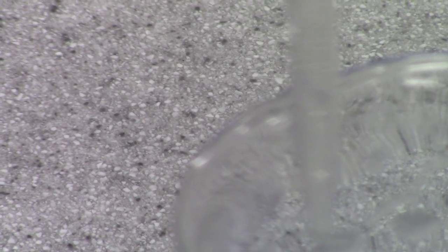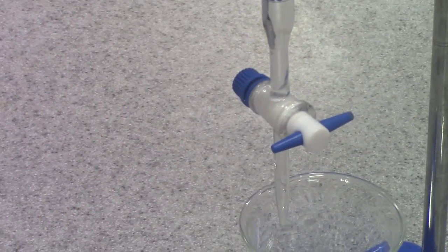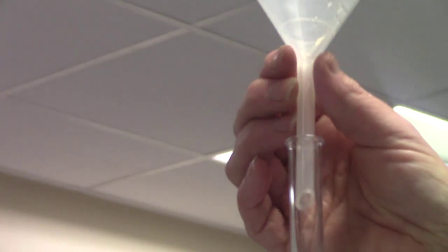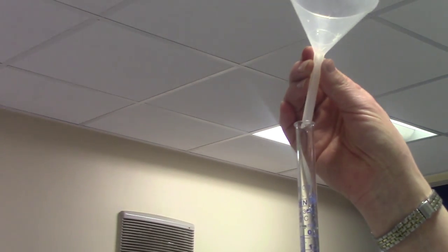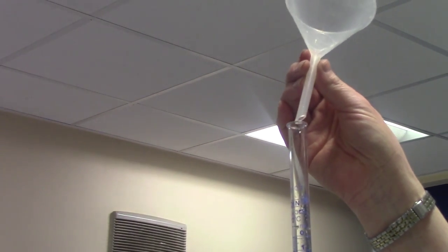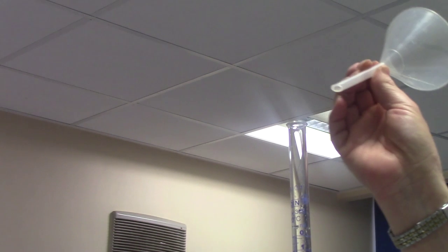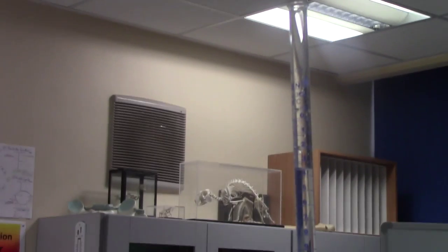Secondly, before I record my starting volume, I'm going to remove this funnel because we can see there's some drops of liquid left in the funnel, and if we don't remove them, those drops could fall in and that will increase or change the volume of titrant that I'm adding or recording.